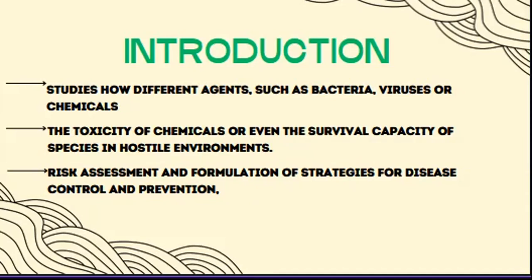The laboratory practice on death curves is essential in various fields such as microbiology, toxicology, and ecology. It studies how different agents such as bacteria, viruses, and chemicals affect the viability of living organisms over time.